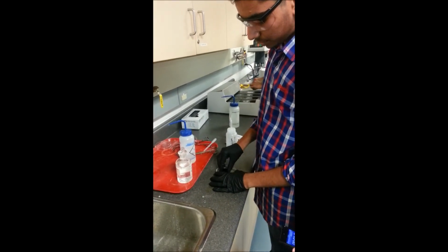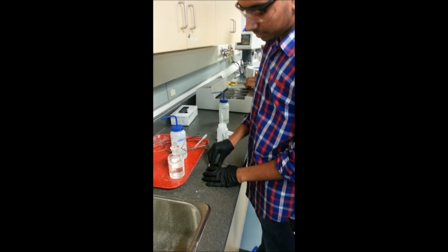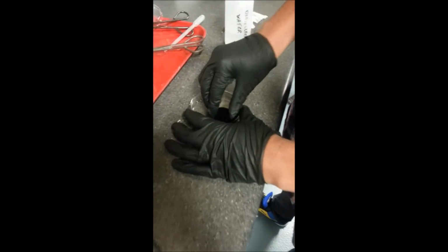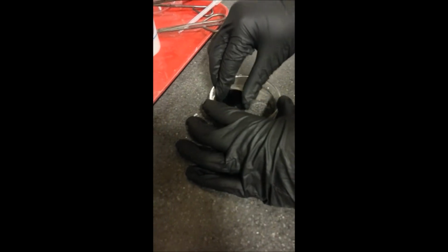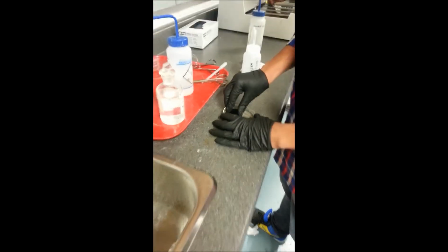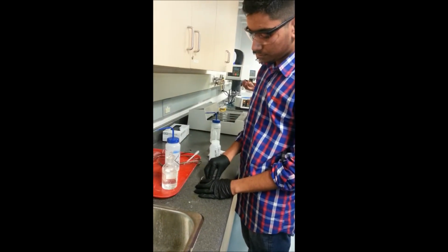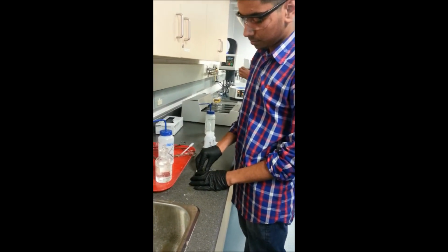And afterwards, when 45 seconds are over, we rinse it with distilled water to stop the etching process. We take a napkin to clean it off. This process will show us the microstructure under the microscope in a very clear manner.